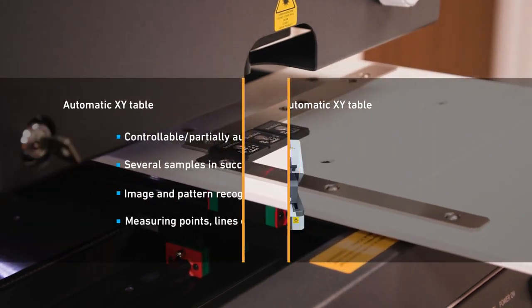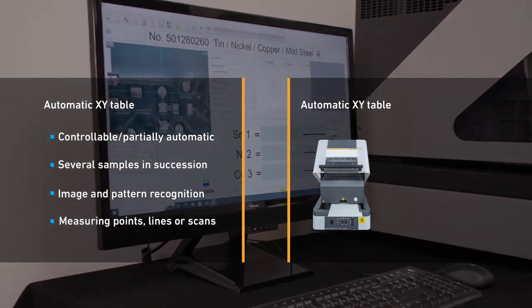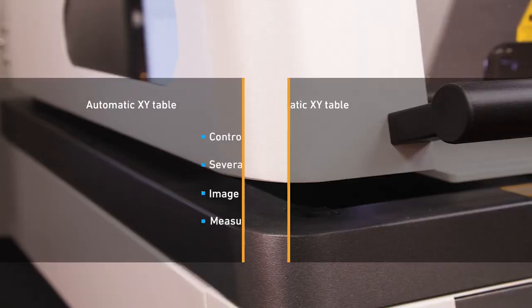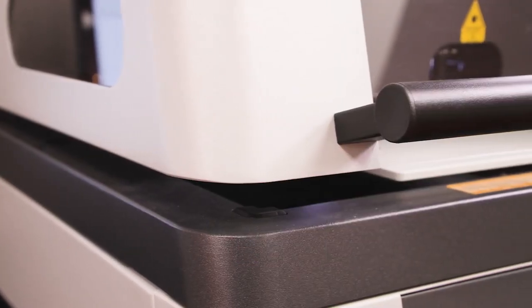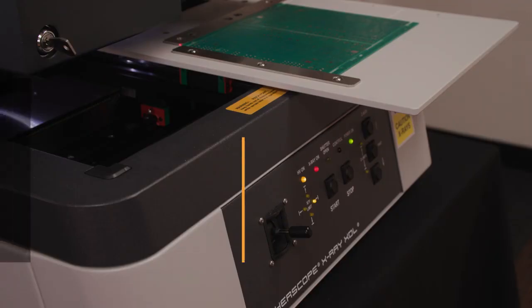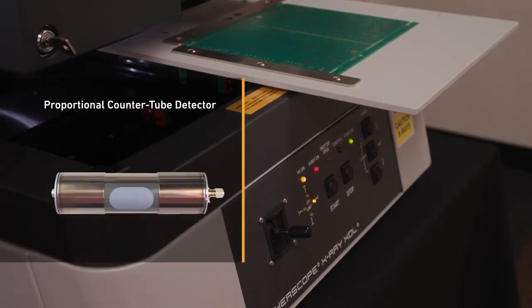With this X-Y table, measuring procedures can be programmed to automatically acquire readings without an operator being physically present. There is a useful C-slot gap, meaning wider shaped parts can fit across into the measuring chamber with ease.